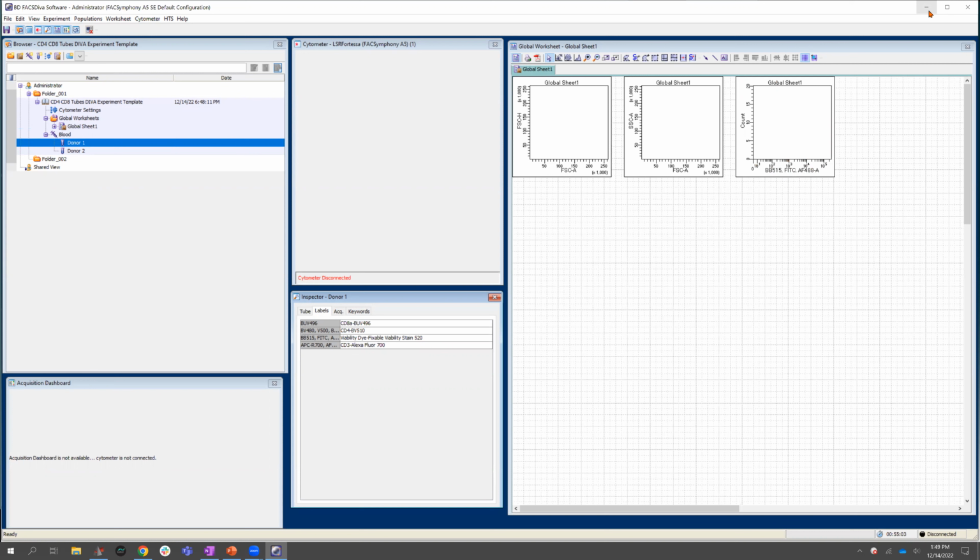So you can see how much easier that can be, especially if you're trying to get to the cytometer to build this experiment, but you're running short on time, or the next user is behind you ready to get on. So you can try to build this as much as possible on your computer. And that way, when you get to the cytometer, all you have to do is maybe add your compensation controls and draw some gates.